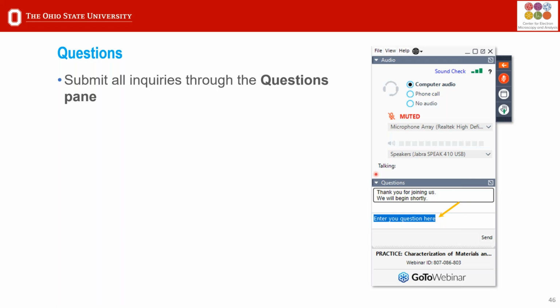Hi, Johan. Thank you very much for that presentation. It was wonderful. We have a few questions, if you don't mind answering a few, and if we don't get to all of them, we'll answer those afterwards. The first question is, how did you select the 127 bandwidth for the spherical indexing? Is that a parameter that you've experimented with?